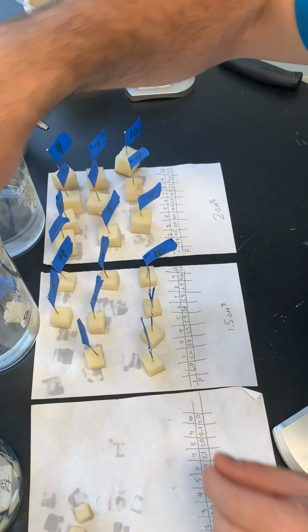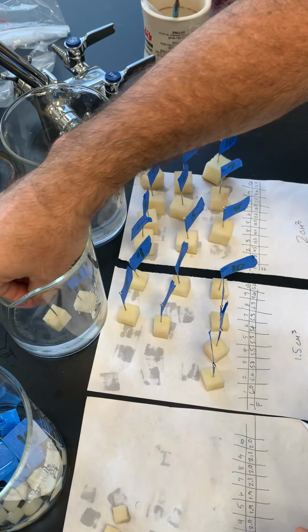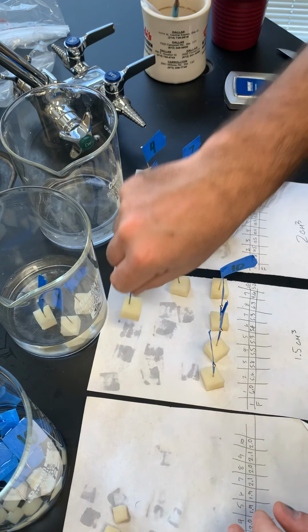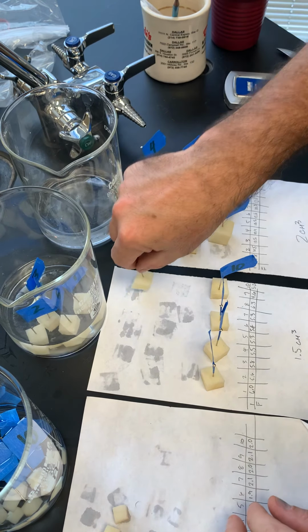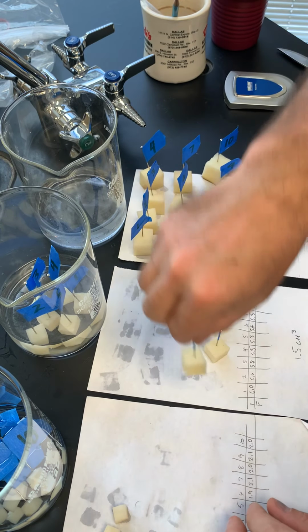So this is gonna be, maybe you can see that a little better. Taking these and putting them in here. They're all standing up like little soldiers. And I've got that pin in there pretty firm. Boy, these are getting kind of crowded.